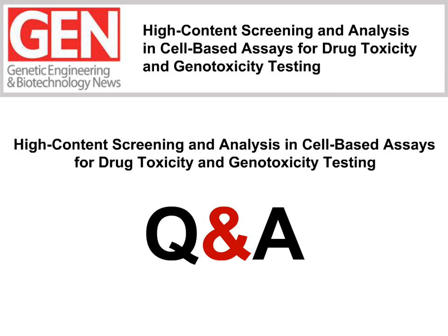Thanks, Heather. Giuseppe, I have another question for you. First, a compliment: great data and compelling evidence that the HCS approach is an improvement. Can you talk to the value of the MN assay compared to other genotox assays such as GADD45A? I have to admit that the question is very interesting, but I don't know this GADD45A assay. I cannot answer this question, sorry. Oh, I'm sorry about that.